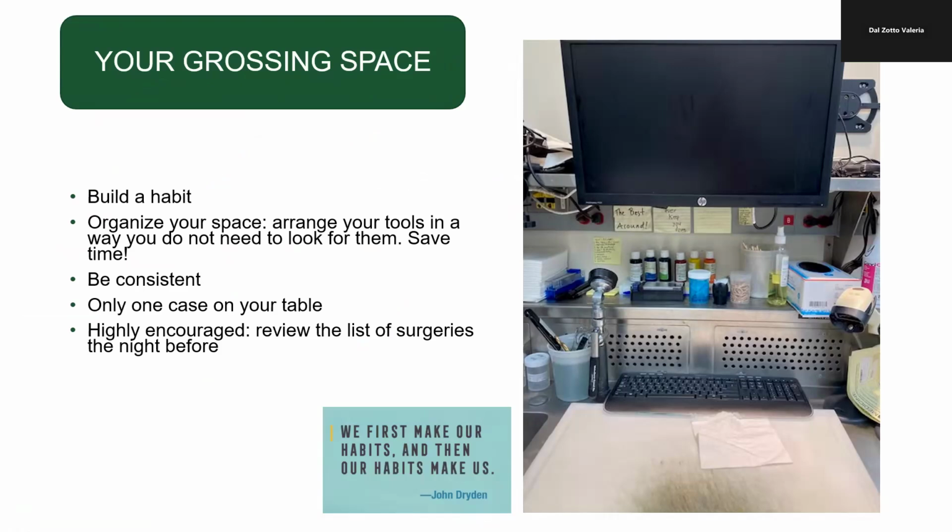Let's talk about your grossing space. I highly encourage you to build a habit. Have your tools always in the same place. I'm going to give you personal tips, but I hope that helps. To me, it helped a lot to have all my table organized.